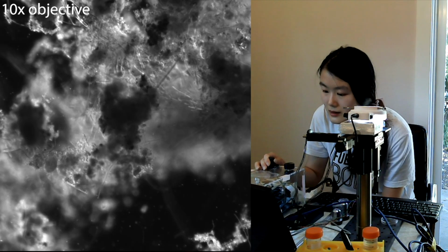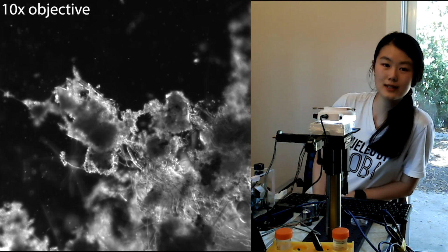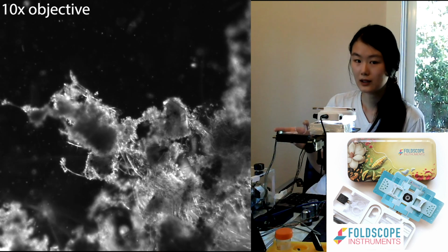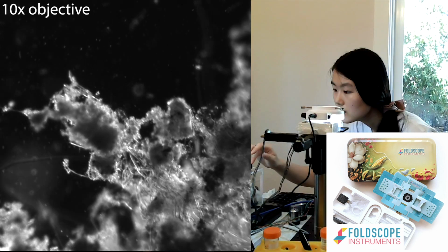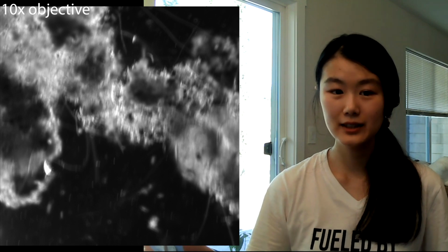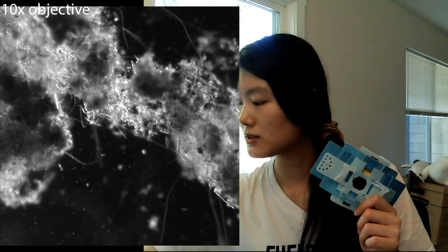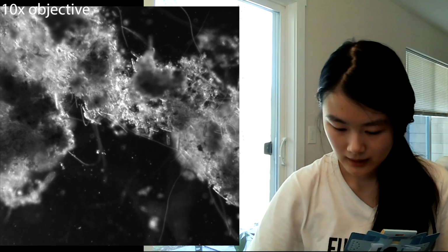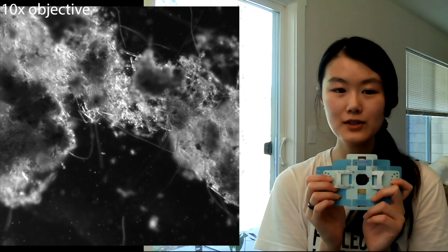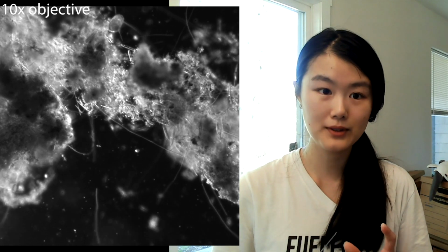Okay, I'm gonna just sit somewhere. So while this is going, I'm curious how the same water will look under a Foldscope. I'm not gonna touch this setup, so we will keep on acquiring this video. Okay, so while that video is still acquiring, I'm curious what the same sample will look like on a Foldscope. So I still have this dish. I'm gonna put it under a Foldscope, which is an origami inspired microscope that costs less than $2 to buy.